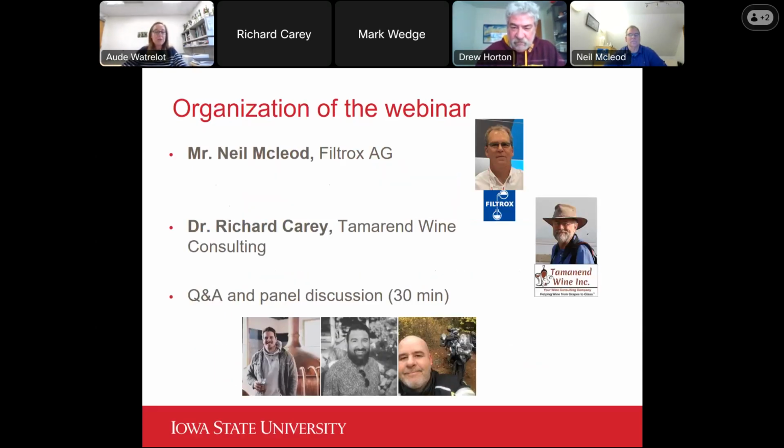So today we will have 2 presentations. The first one is from Mr. Neil Mcleod from FILTROX AG. He will introduce the role of filtration of wine and present the potential risks for not using filtration, and also give a description of depth filtration, for about 25 minutes.